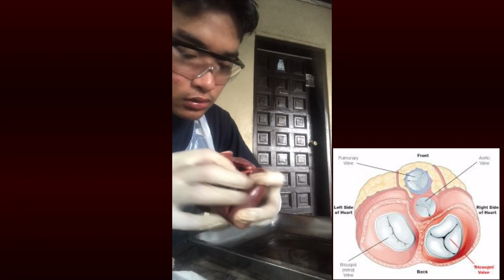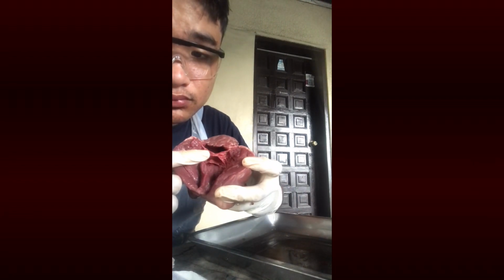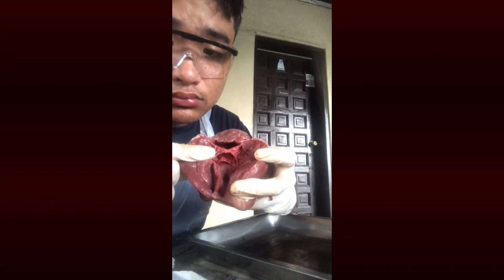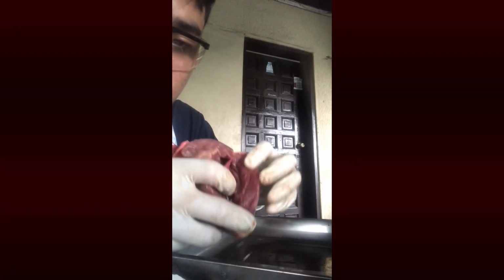Inside this chamber, look for the valve that controls blood flow between the upper left atrium and lower left ventricle. This valve is called the bicuspid or the mitral valve. This valve consists of two leaflets, and blood flows from the left atrium into the left ventricle during diastole.